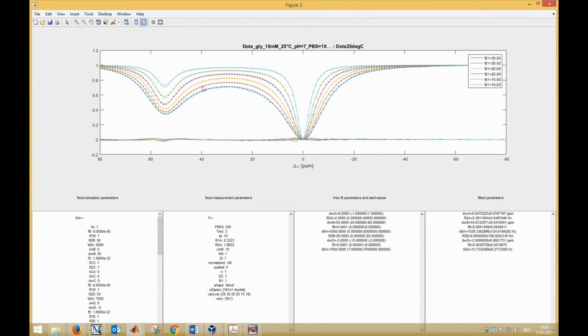And you see here now the summary of all we did. We set up the simulation, then we overrode some parameters by measured parameters, or really set parameters, in the parameter struct P loaded from the Excel file.